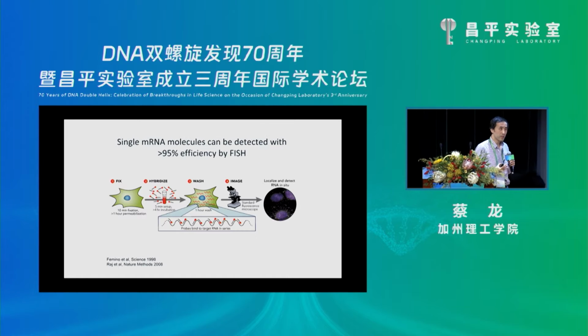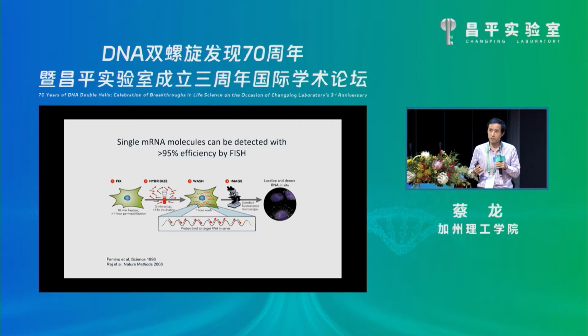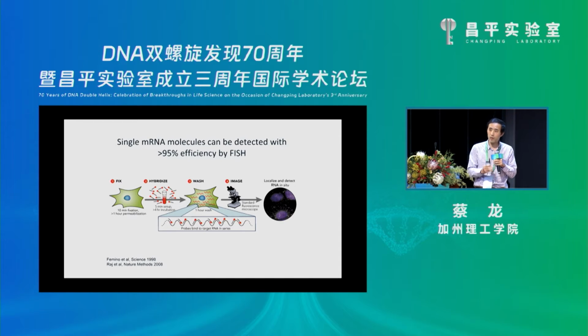So the technology itself is built upon single molecule FISH, which was pioneered by Rob Singer and Arjun Raj, using short oligo probes that then go in, hybridize in tissues, and give you these distinct spots in cells when you look at them on a microscope. And then to give you a single molecule counting of the transcripts directly in the individual cells.